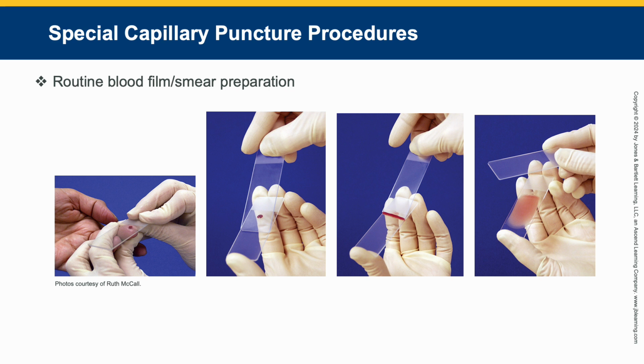Also, you need to be aware that any unfixed slides, meaning that they are not dry or not ready, any unfixed slides that don't have a fixative on them or a cover, are capable of transmitting disease and you're going to handle them accordingly.